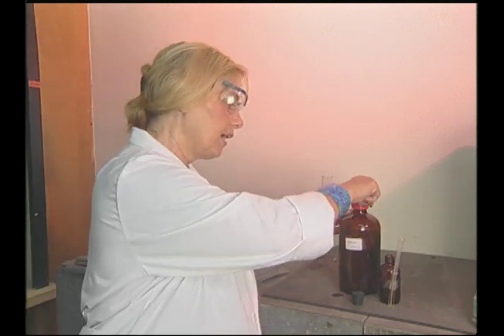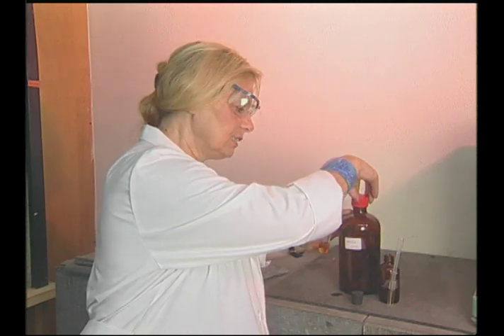These two solvent systems are not miscible with each other. So they make an interface. They don't make a pure solution. You can see the little barrier where one liquid sits on top of the other. We call that a phase difference.